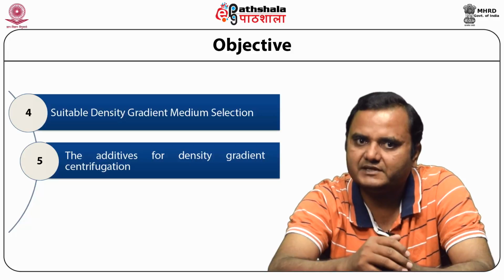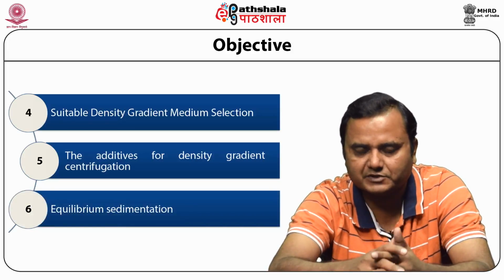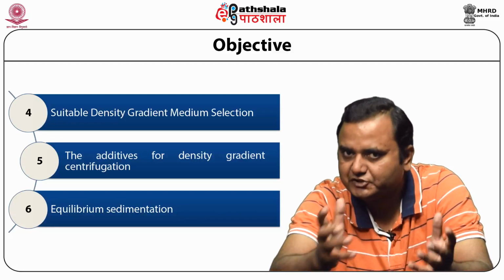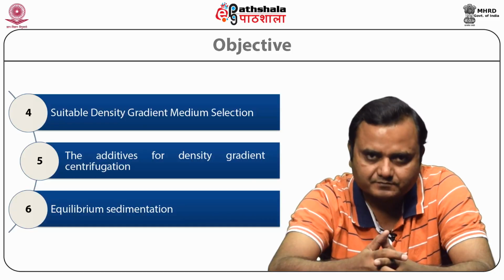And at the last, we will discuss the equilibrium sedimentation process that is used for the separation and calculation of some information about particular molecules.